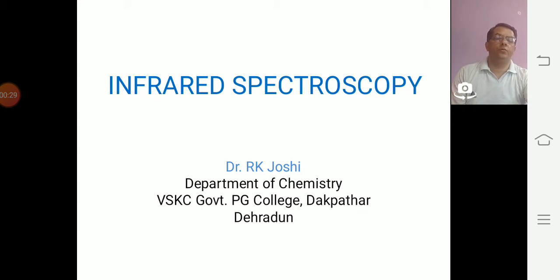Low energy radio waves, for example, cause nuclear spin flip transitions, whereas more energetic UV radiation results in electrons being promoted to higher energy levels. Due to the low energy level in IR, only vibrational excitation of covalently bonded atoms and groups occurs.